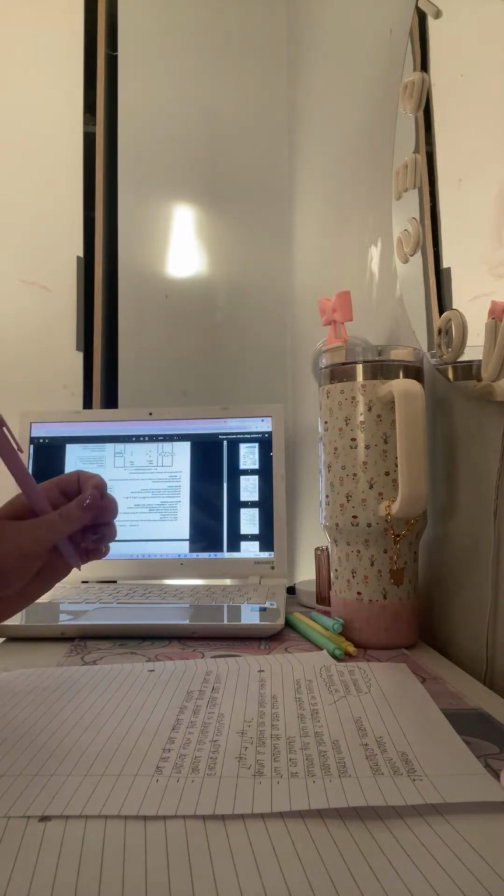So, the steps we've just gone through: the sample is dissolved in a volatile polar solvent. Polar is important, and so is volatile. It's injected with a fine needle, giving a fine mist, and the tip of the needle has a high voltage.